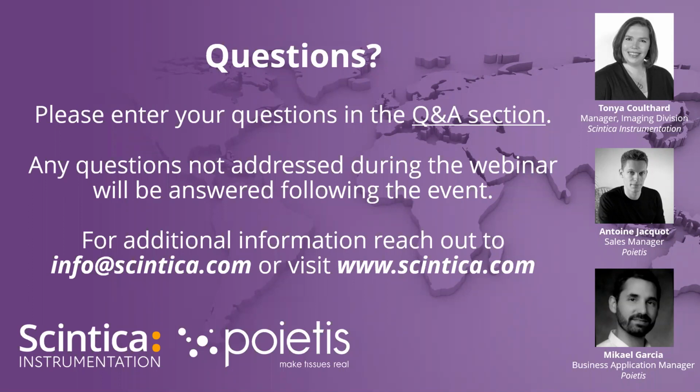So yeah, for security reasons, of course, yes, it has to be closed because inside there is, as you said, the laser. For security reasons, we've got a specific treatment of the glass, and the glass has to be closed to use the laser. But also we've got a robotic arm moving inside. So of course, if the glass is not closed, the robotic arm cannot work. The laser either. So the only use that we've got with the hood open is like a usual cabinet to go with the cells, with the preparation of the materials and everything else.